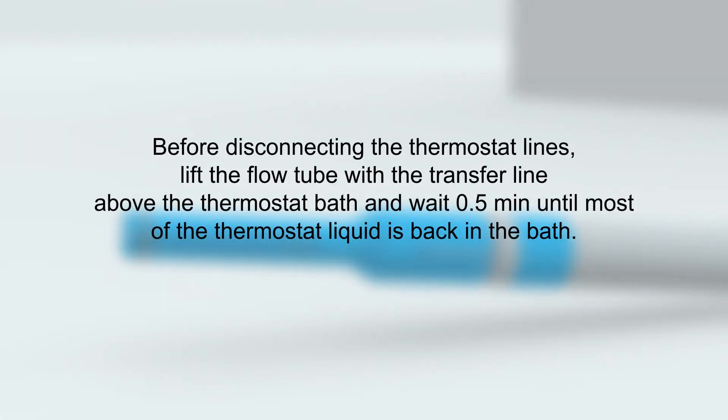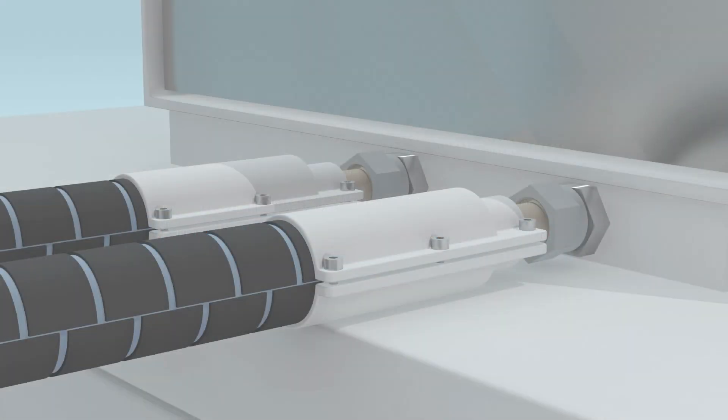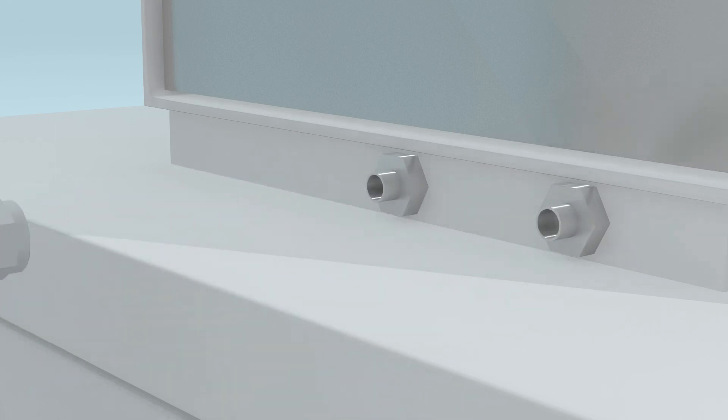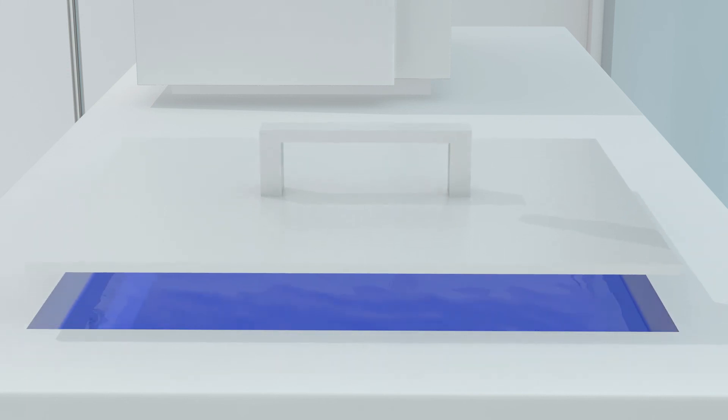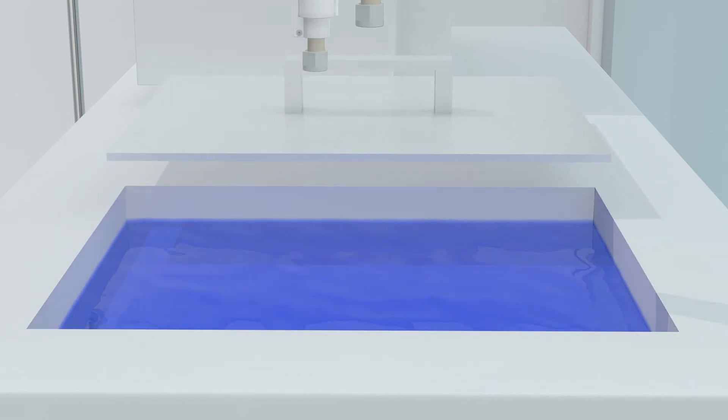Before disconnecting the thermostat lines, lift the flow tube with the transfer line above the thermostat bath and wait for half a minute so it drains. Then disconnect the inlet and outlet to the thermostat and suspend the connectors above the bath so that the thermostat liquid drains into the bath.